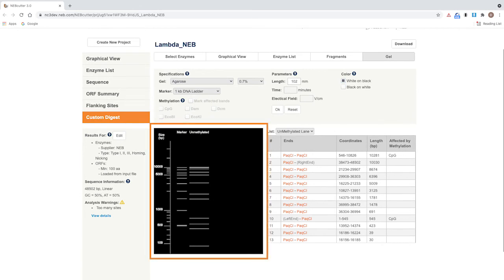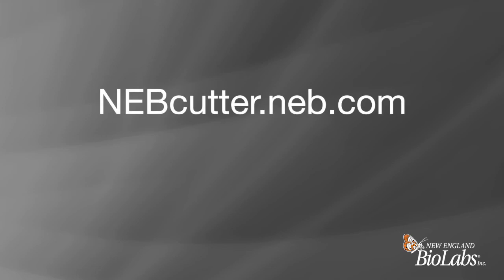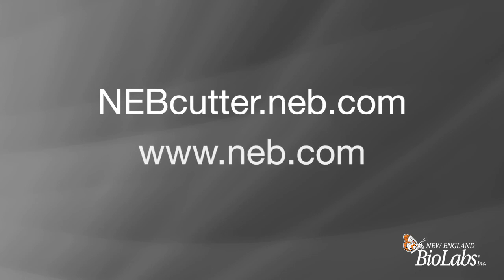You can now see the expected band pattern for a PacI digest of Lambda DNA. You can find NEBcutter at nebcutter.neb.com. For more information on restriction enzymes and how-to videos, visit www.neb.com.